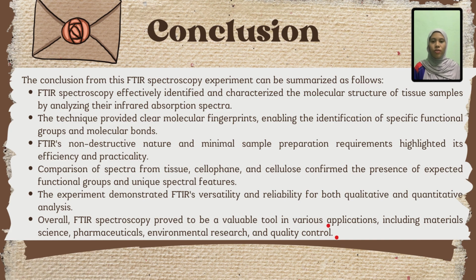For conclusion, FTIR spectroscopy effectively identifies and characterizes the molecular structure of tissue samples by analyzing their infrared absorption spectra. Second, the technique provided clear molecular fingerprints, enabling the identification of specific functional groups and molecular bonds. FTIR's non-destructive nature and minimal sample preparation requirements highlight its efficiency and practicality.